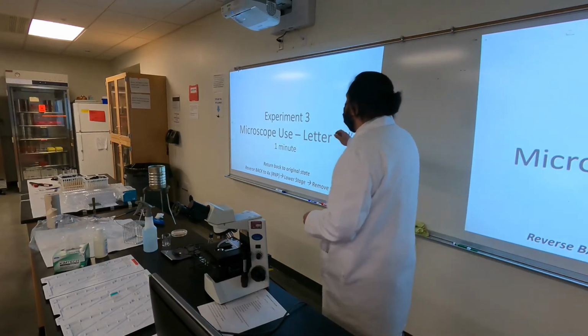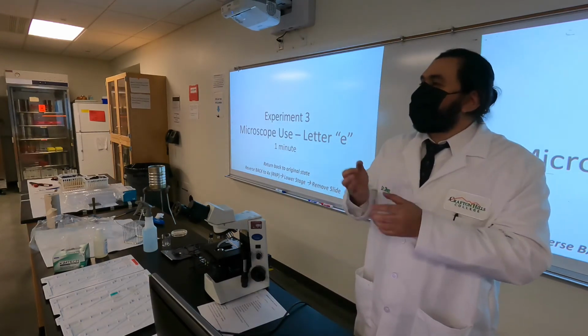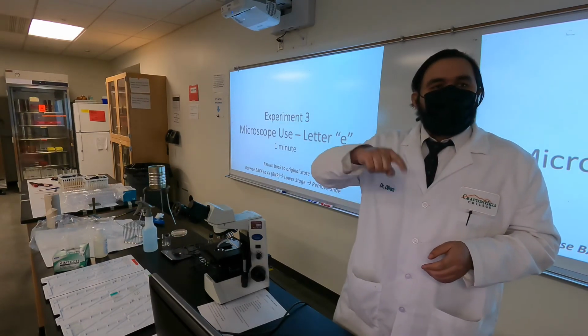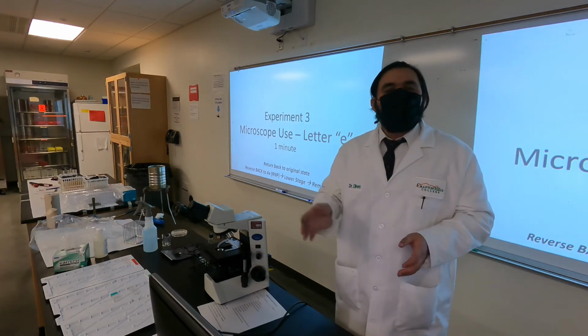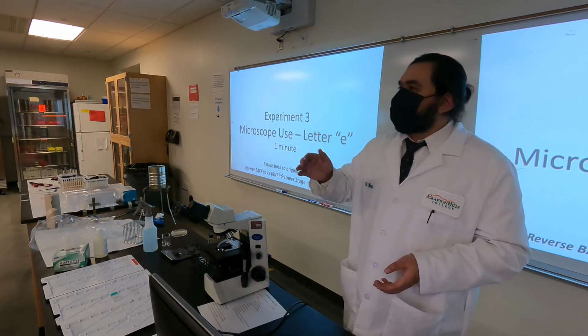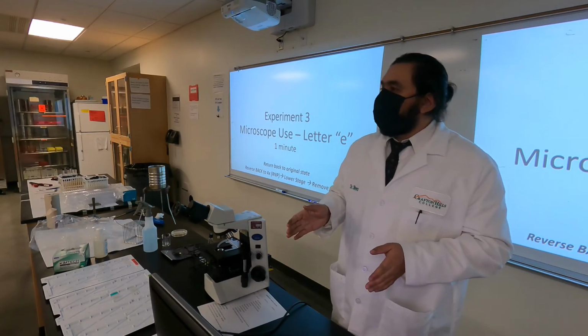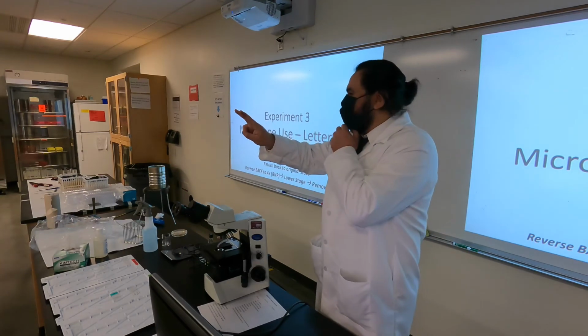So far we went through 4x, 10x, and 40x, so the 40, 100, and 400 total magnifications. And now we're gonna go in reverse so that we can take out the slide on the 4x. That's always the rule. Bring it down to the 4, bring it down to the red, and then take your slide out and clean it off. Okay, that's part of the plan. And now you've been trained on how to do that in 2 seconds.